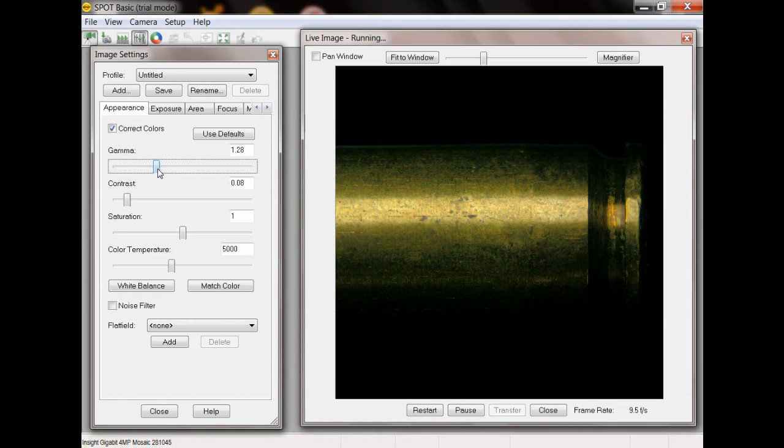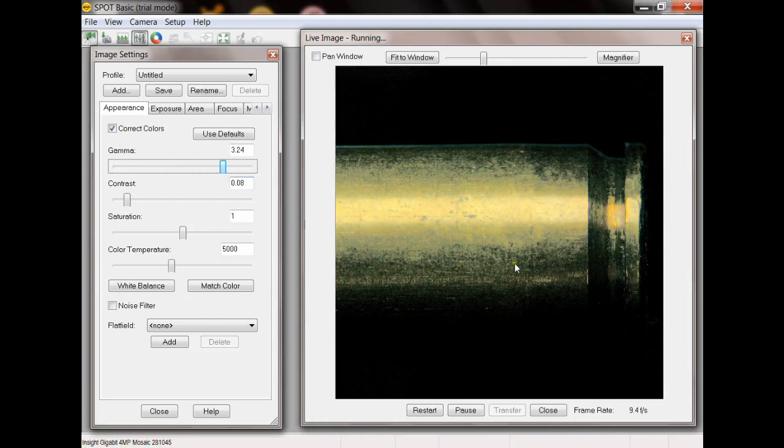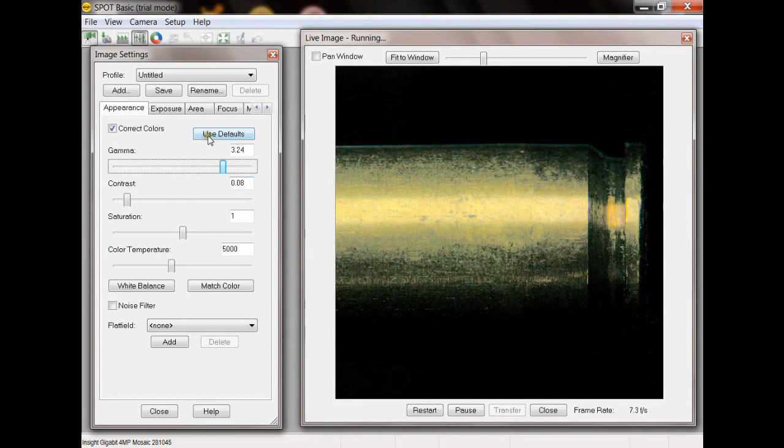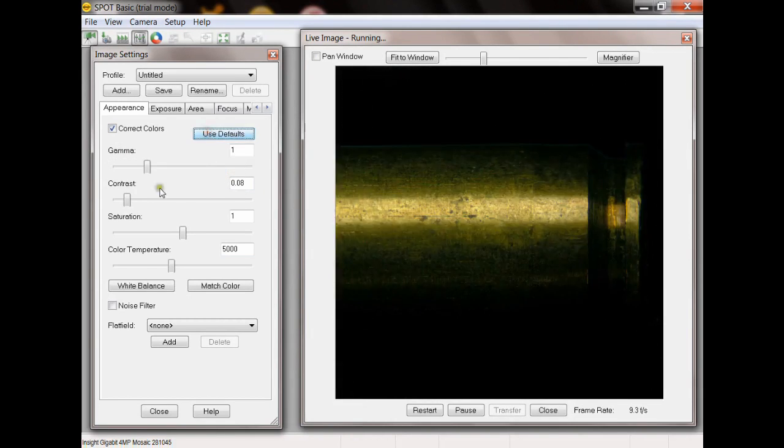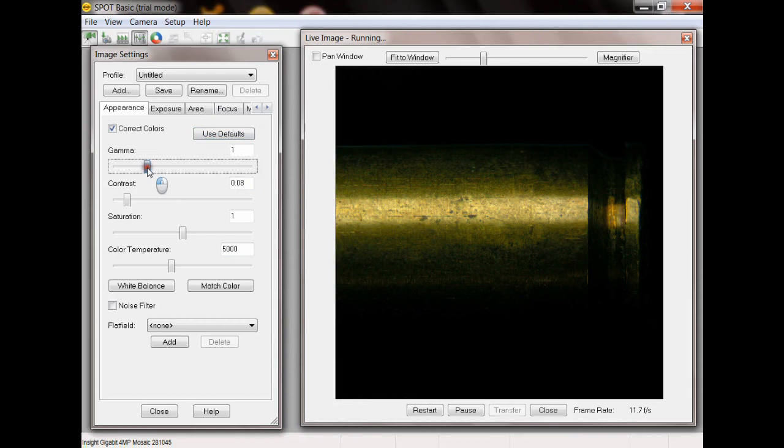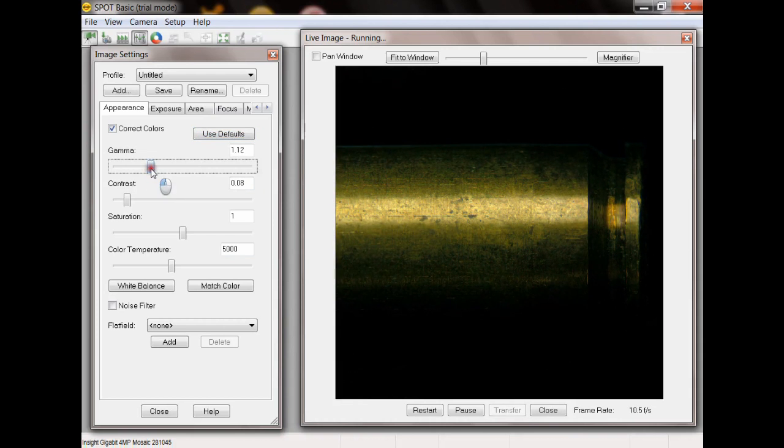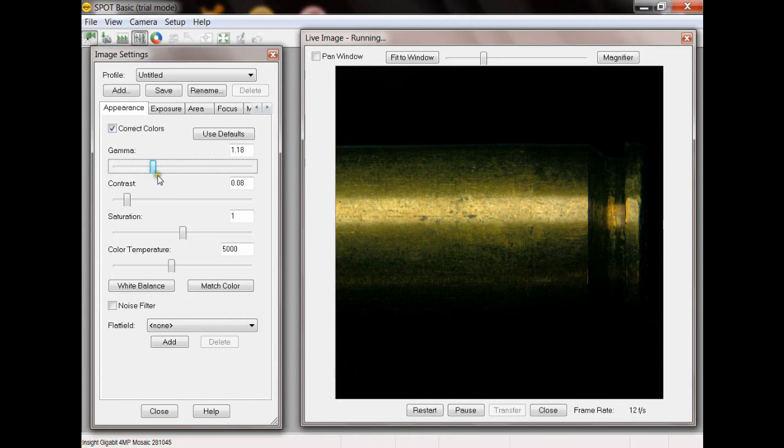Now you can overdo it. If you bring it all the way, you'll start to see some kind of weird things happen to your image. That's why you have the use defaults button. But if you do it right, you can cause your image to be a more dynamic range image which is going to be more similar to what you see through the eyepieces.